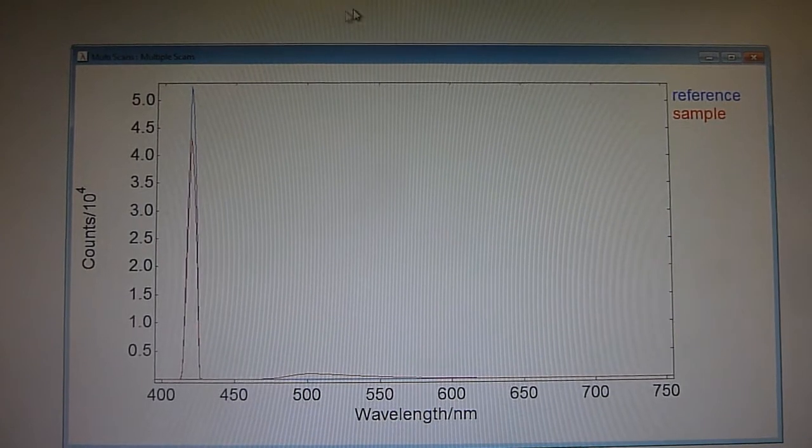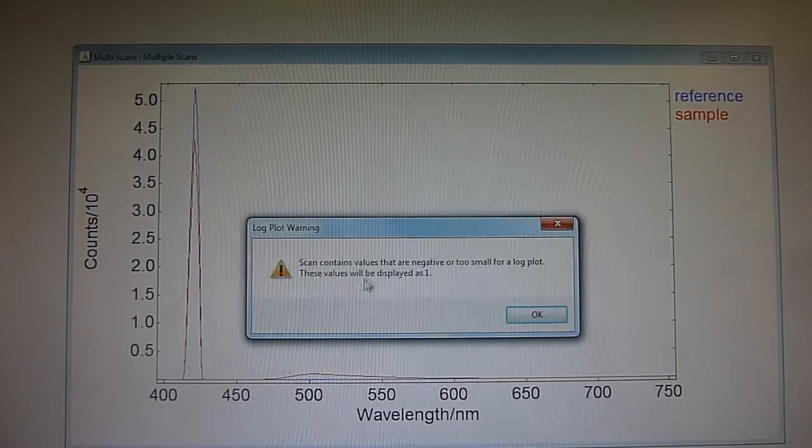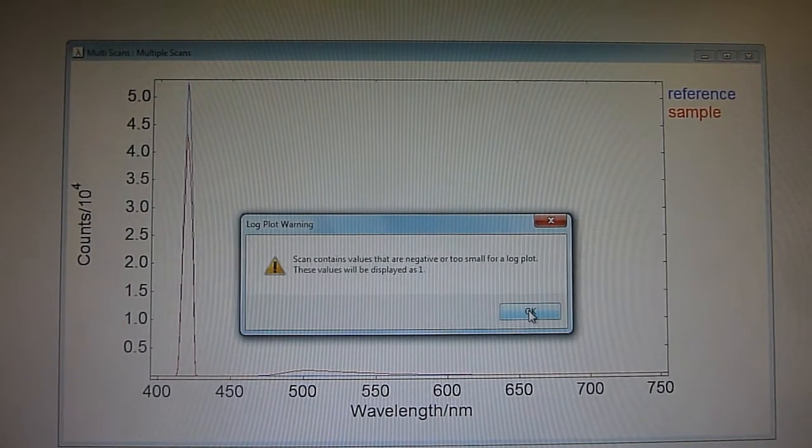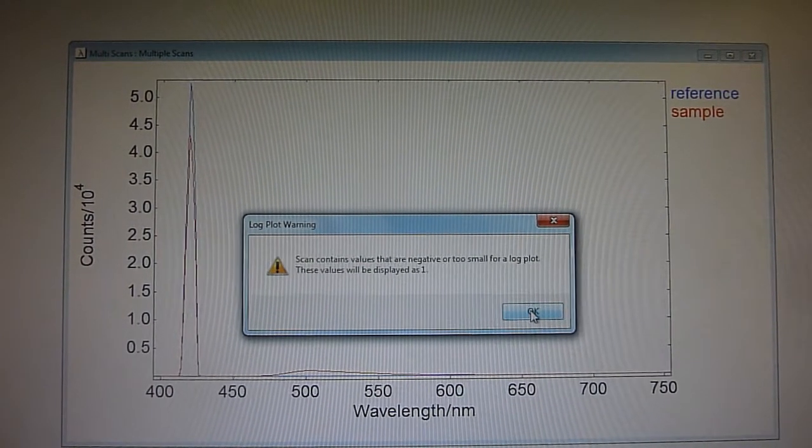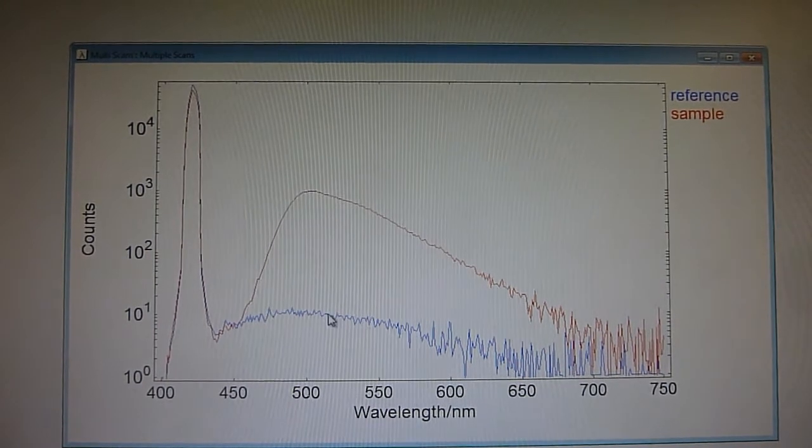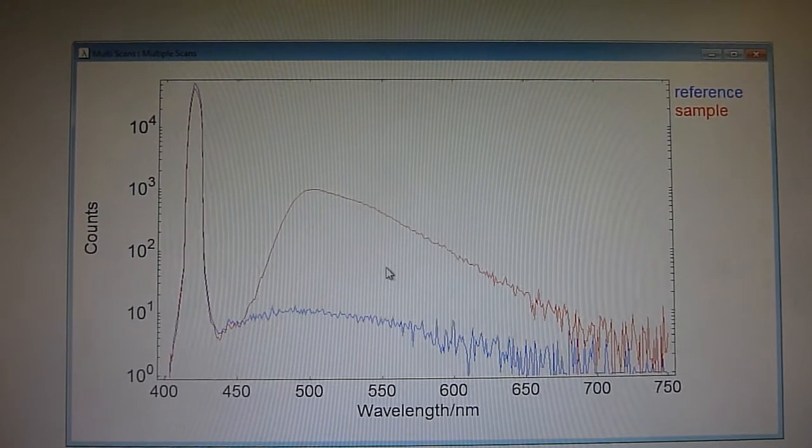So let's try a measurement here. Let's just quickly look at this curve on a logarithmic scale. It's kind of shouting at me right now because we have some zero values here, and that's essentially just because we have zero photon counts in some areas but that's fine. And here you can see that there's quite a substantial amount of fluorescent over in this region here.